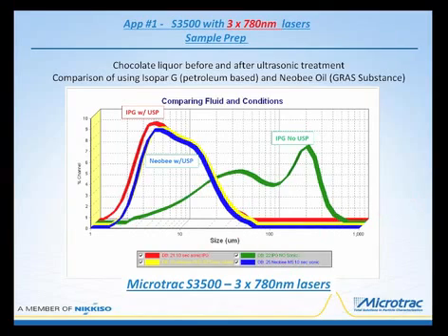By the way, if you have any questions about these things and you want some information on how to obtain some of these compounds, just let me know and I'll make sure that you get the information. So we can use lots of different fluids, and the different organic compounds include all organic solvents. The system is designed for dealing with them because of the glass. The system is glass, Teflon, stainless steel, and solvent-resistant fluoropolymer O-rings.